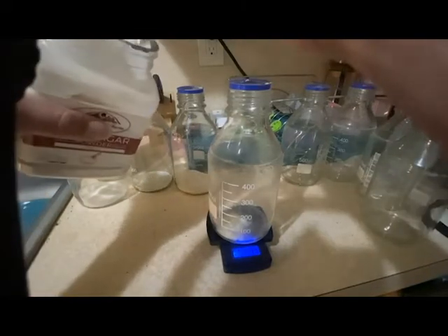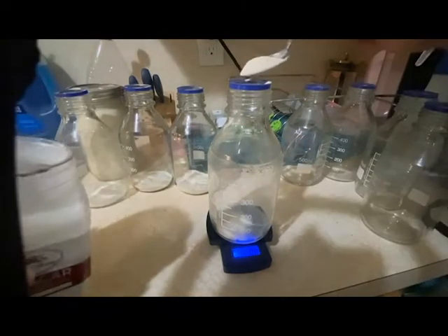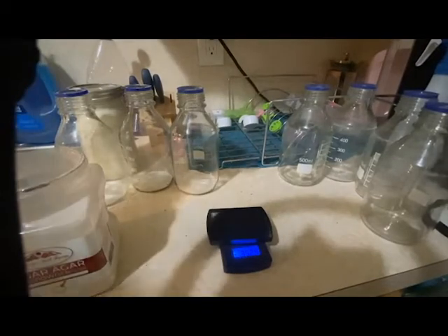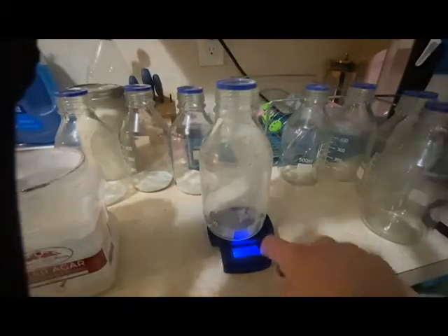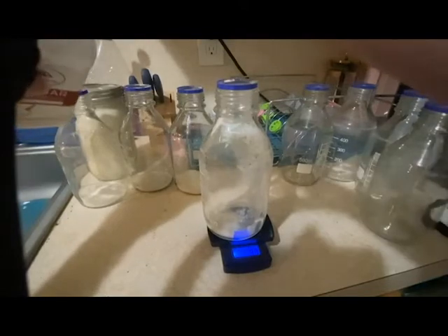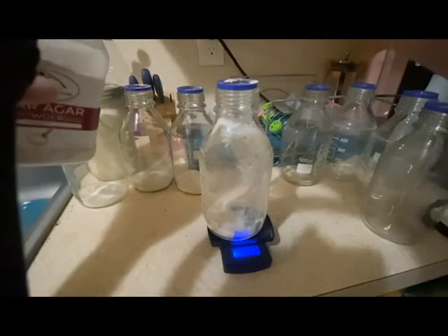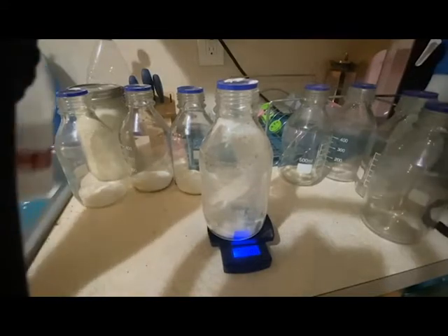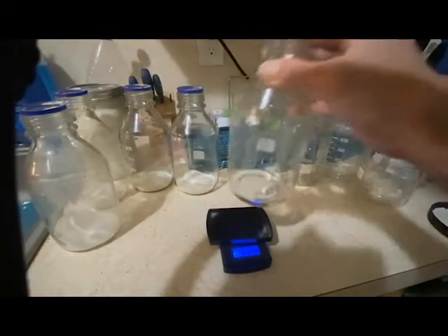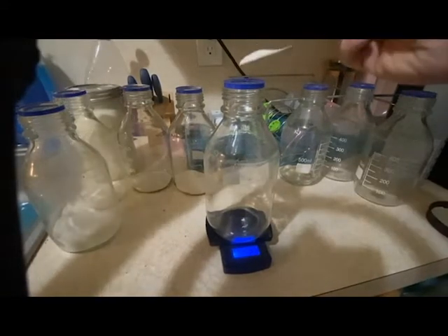I like my agar a little on the thicker side. So what I do is I measure. Well, that's not good. I forgot to tare my scale. I like my agar a little bit on the thicker side, so I do 10 grams agar with about 9 grams malt extract, and I fill it only up to 400 milliliters. I know a lot of people like to do 10, 10, 500, but I don't know. I think it's a little too runny for me.